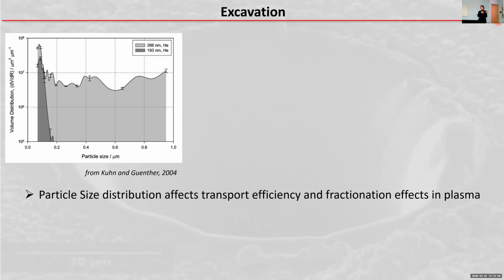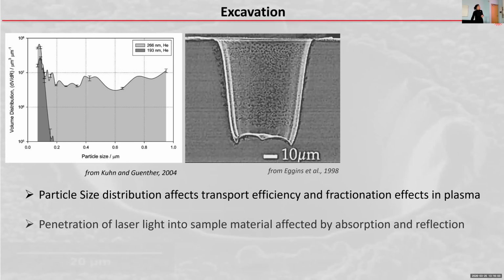In the conventional ICP-MS method, you have a liquid, and that liquid needs to be brought into the plasma as fine particles. The finer the particles, the smoother the signal will be, and the better your results. This is exactly the same for the laser. The finer the particles and the more uniform the particle sizes, the better the response of the ICP-MS.